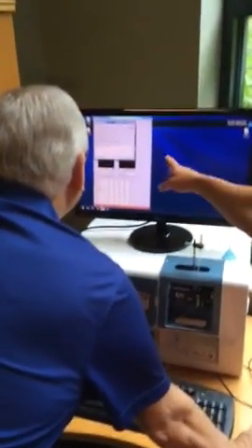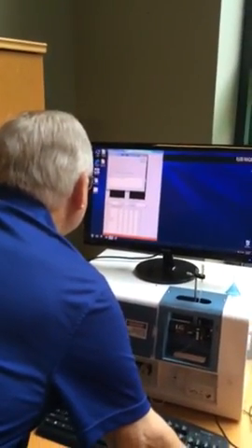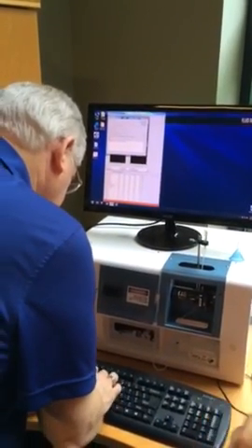In this case, we're just going to ignore the notes. In your case, the notes might be extremely useful as far as which data run you're going, what your objective was when you ran the sample, etc. I'm just going to do this, just for the heck of it.